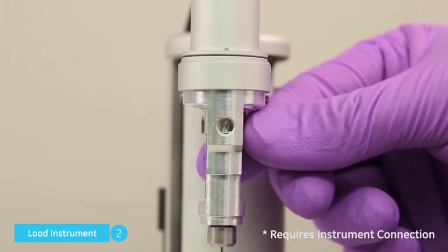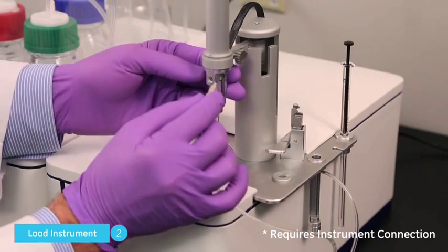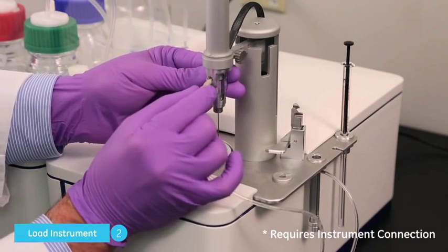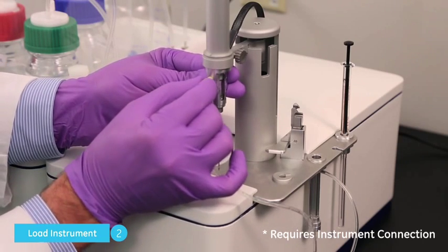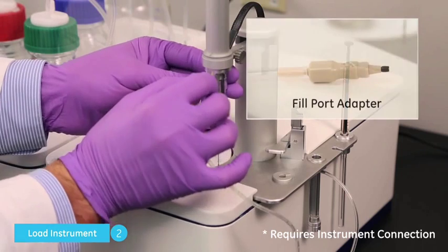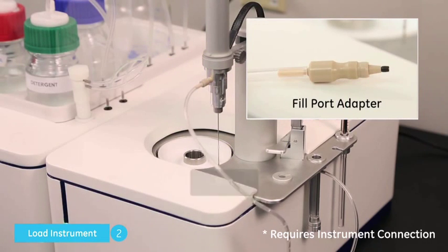Align the hole in the pipette's rotating assembly to the hole in the pipette housing. Insert the FPA. You should feel a soft click. Click Next.